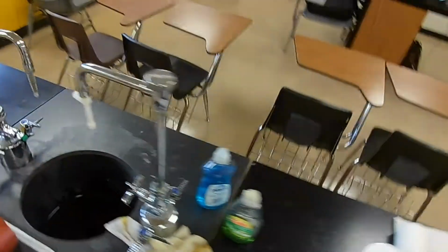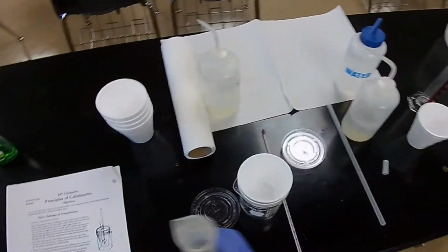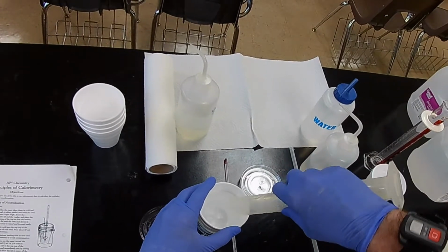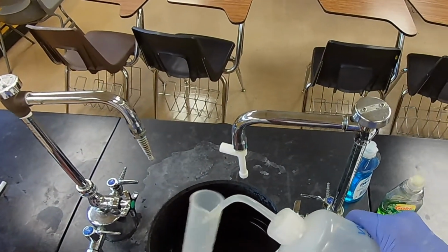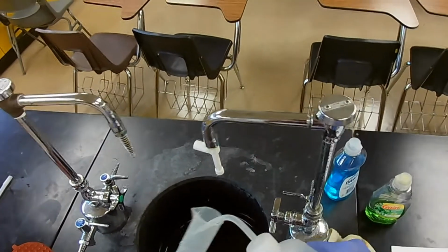Here we go. And this is safe enough to rinse down the drain. That's had acid in it, so I'm going to keep it with the acid bottle. And this goes in the calorimeter. All right, let's rinse that out so we can use it again for the base. That's the acid.